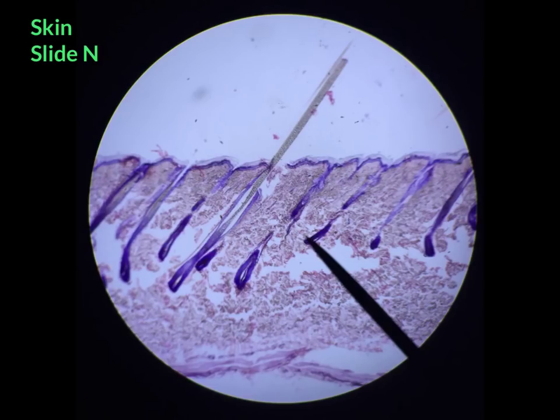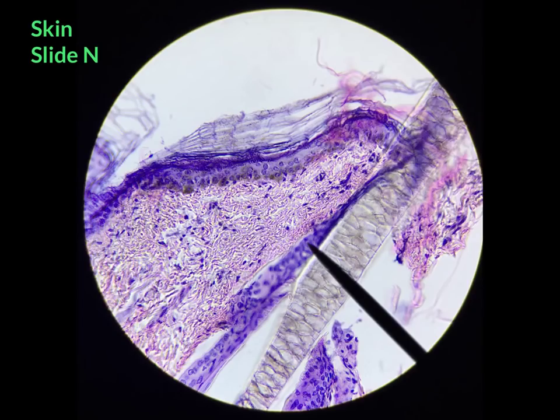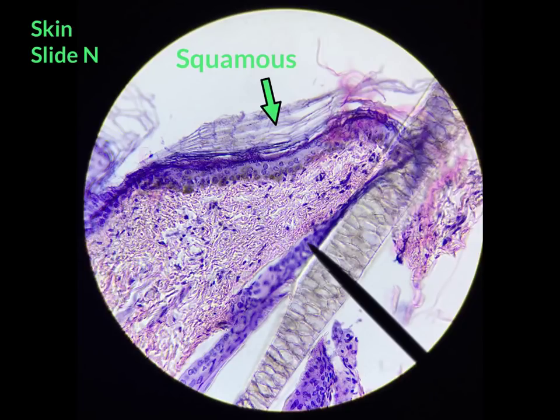Next, we are going to take a look at stratified squamous keratinized epithelial tissue from a cross-section of skin on slide N. There is a multitude of different tissues on this slide; focus on the purple area at the top. Under high power, you can see that the cells closest to the connective tissue are cuboidal cells. As these cuboidal cells undergo mitosis, some are pushed toward the surface, fill with a protein called keratin, become squished, and essentially become squamous epithelial cells. The naming of stratified epithelial tissue comes from the name of the cells furthest away from the connective tissue.